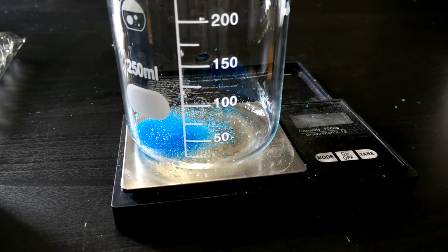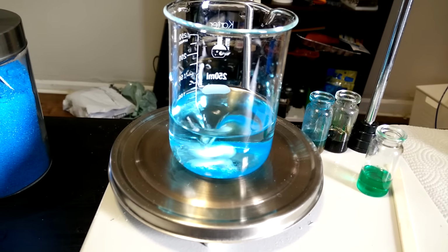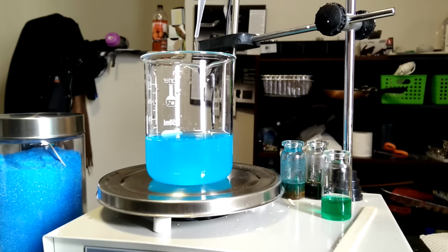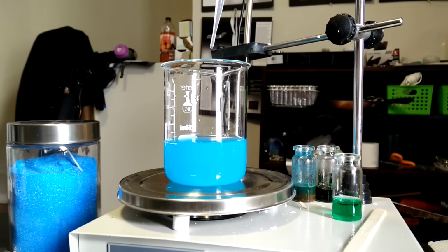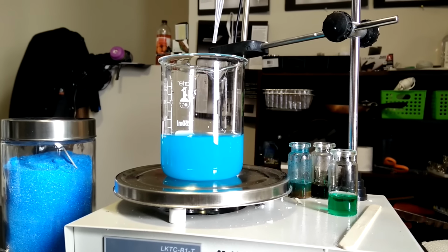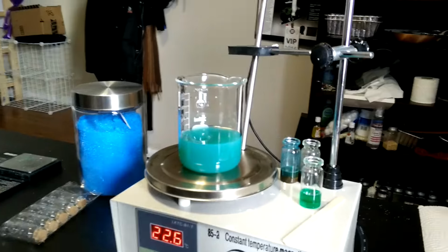To begin, we get some copper sulfate, I used about 2 grams in this case, and dissolve it in deionized water. I'm using 100 milliliters. Then we add some 30% sodium hydroxide solution to form copper hydroxide. In this run I used a milliliter, but that wasn't enough, as you'll see later. Slowly add the hydroxide and mix the solution so that it's a homogeneous opaque blue, and I'm using a lab stirrer for this. Then we add in small amounts of ascorbic acid at a time.